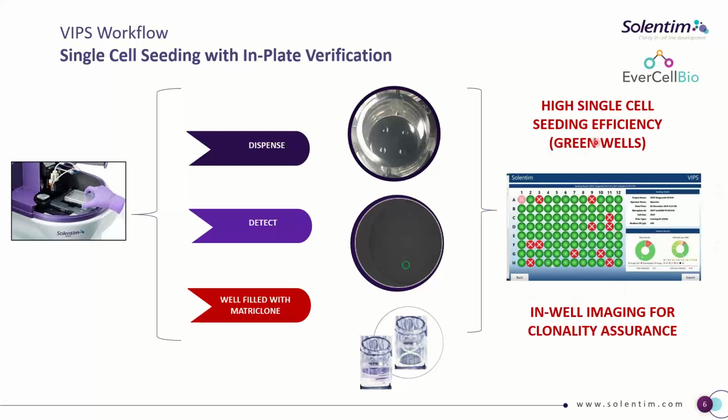The key thing with this is we mentioned efficiency, but it's also the droplet image that you see over here in the middle, because the droplet is the kind of key additional image here, and it's the first image in that clonality report for the regulator. And I always call it the inception of clonality. That's the first time you see the single cell in the well, and it's in that droplet.